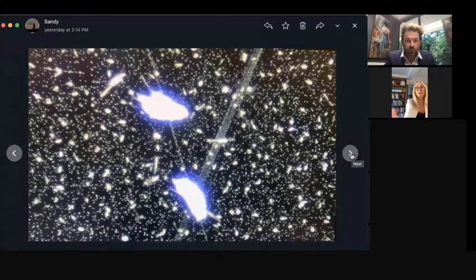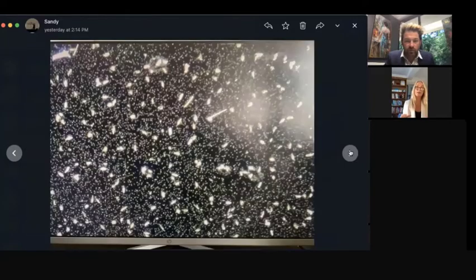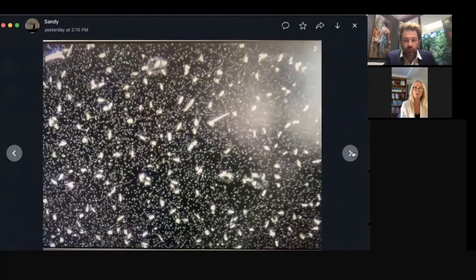But what was so interesting is, I think you've got a picture of when I first put the Clean Slate on the slide, and I went away for the afternoon. There we go. So that's the first one. You can't see the ultraviolet light at that magnification, but you can see all the structures inside the Clean Slate solution.